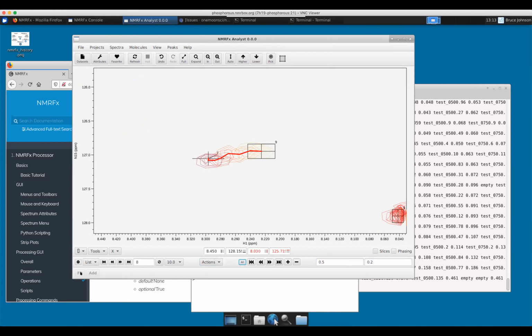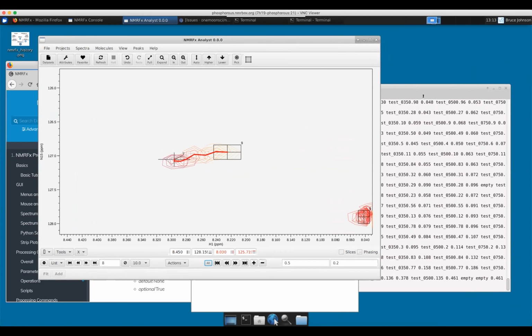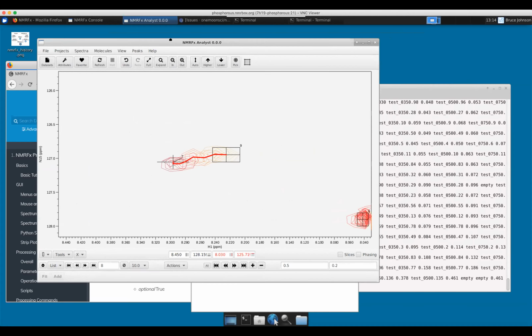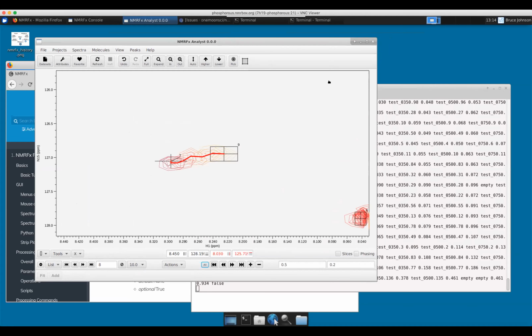As we go to each peak, we can hit this fit button and it will pop up a little secondary window that has an XY plot that shows the titration. That's what should be popping up. That's really mysterious. There are no error messages. If you hit fit, it'll do a titration curve fit, show you here the KD and an error bar for the KD.